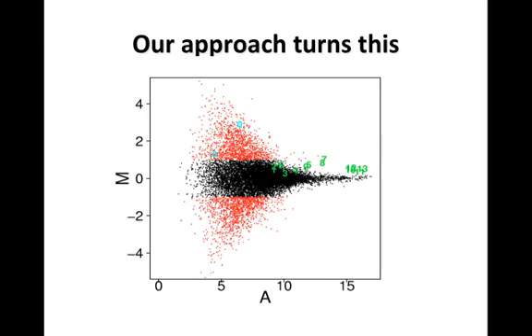Okay, so this is the original approach, the PM minus MM approach, and you can see now these greens, I can explain what they are. Because this is a spike-in experiment, these are the genes that have a fold change of 2. That's what they should be. And then this one is the 1000 versus 0 gene, and this is the 0.25 versus 0 gene.